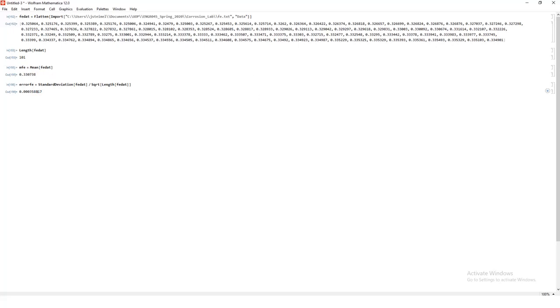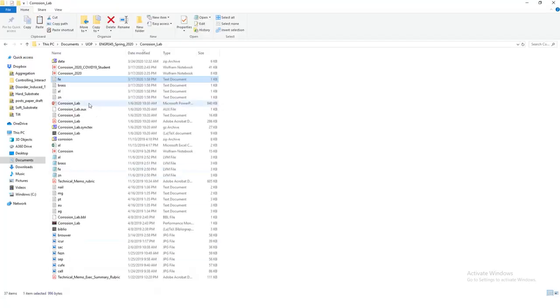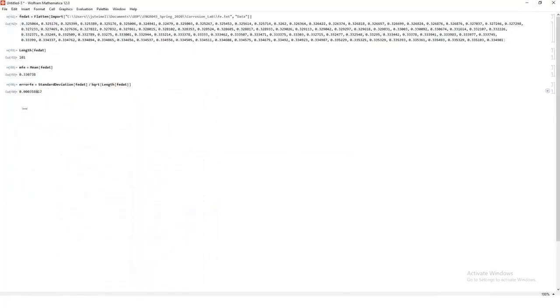That's it. You have all the data files for brass, aluminum, zinc, magnesium, platinum, gold, and Ag. So we have a positive voltage. Where are the electrons flowing if we have this positive voltage? Well, we know that if it's positive, electrons are flowing from the anode to the cathode. That makes sense, right?